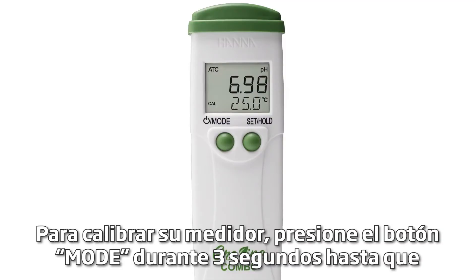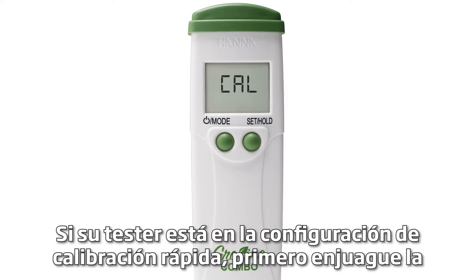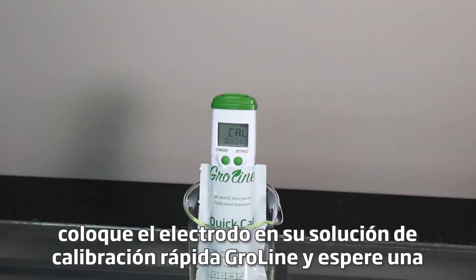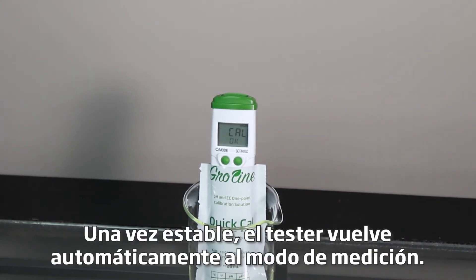To calibrate your meter, press the mode button for three seconds until Cal is displayed. If your tester is in the Cal quick setting, first rinse the probe in distilled or deionized water. Place the electrode in your GroLine quick calibration solution and wait for a stable reading. Once stable, the tester automatically goes back to measurement mode.